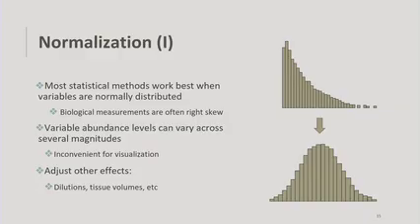We also sometimes, especially when we're measuring samples, have different starting volumes or some different thing about the measurement, and so our whole distribution might be shifted a bit. In that case, some sort of centering method is helpful to try and align all our distributions together. There are custom things that you can do as well if you have some known parameters like dilutions or tissue volumes.